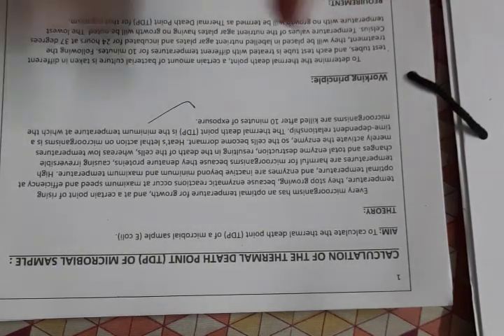There is a certain temperature after which the microorganisms cannot live. And why does it happen? At lower temperature, the enzymes of the microorganisms are sort of inactive, but on increasing the temperature, the activity of the enzymes keeps increasing. Generally, roughly on a 10 degrees Celsius increase, the activity of the enzymes doubles.